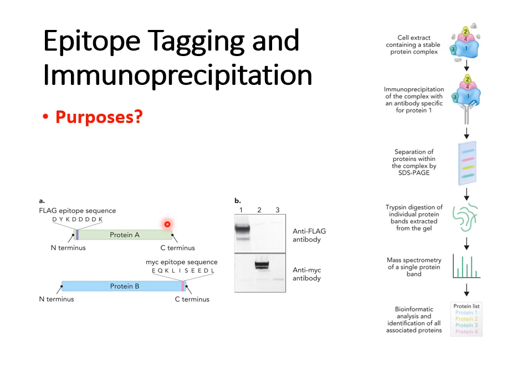So, very valuable to us. Epitope tagging is when you put a small amino acid sequence onto your protein. Immunoprecipitation is when you use antibodies to pull down your target protein from a mixed sample and collect just that particular protein.